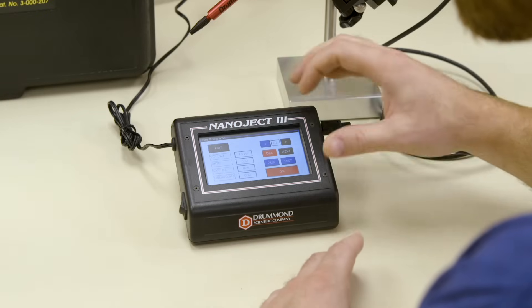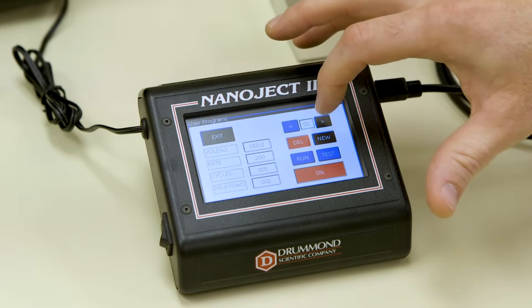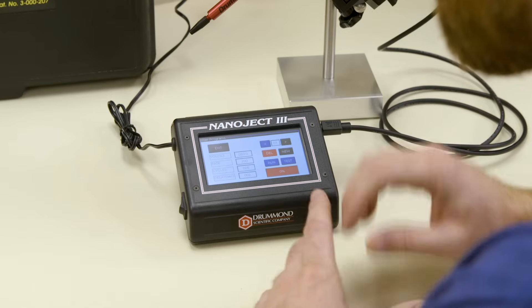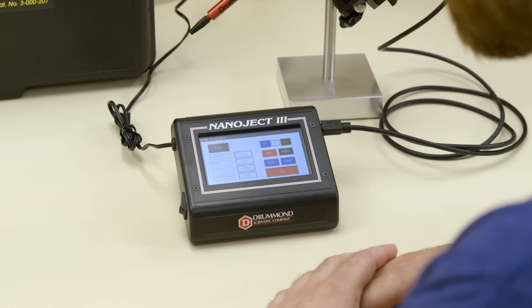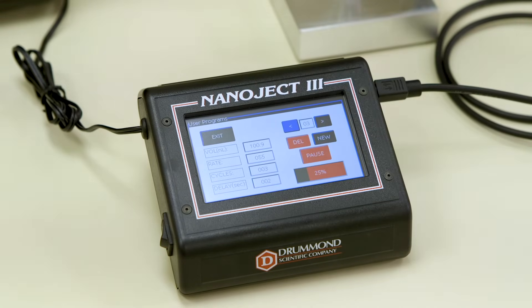You can save several recipes which are saved in sequential order and can be accessed by pressing the right and left arrow icons. They can also be deleted by pressing the Delete button. You can also test your injection one time. When your test is complete, you will hear an audible beep. To start your programmed recipe, press Run and you will see a countdown begin, ending at 100%. You will hear a triple beep when it is complete.